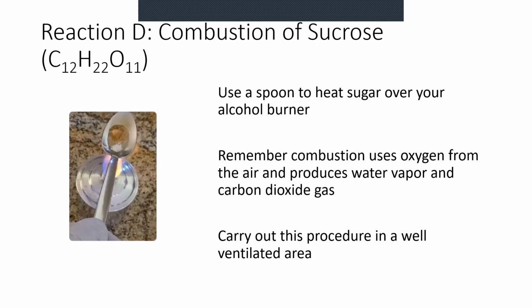Reaction D is going to be the combustion of sucrose. To do this, you're going to take a spoon and heat some sugar over your alcohol burner and watch what happens. Remember that combustion uses oxygen from the air.